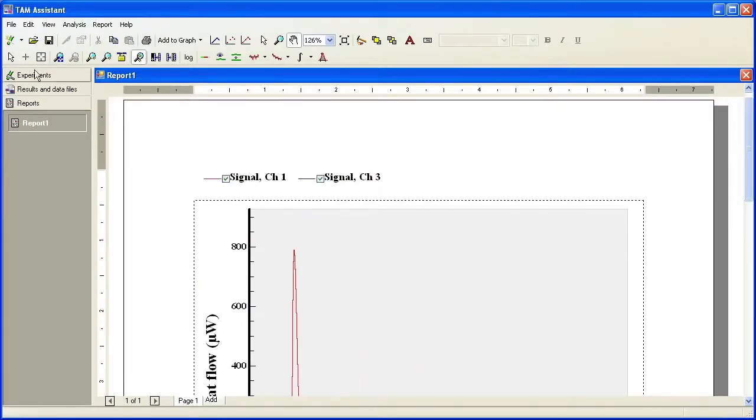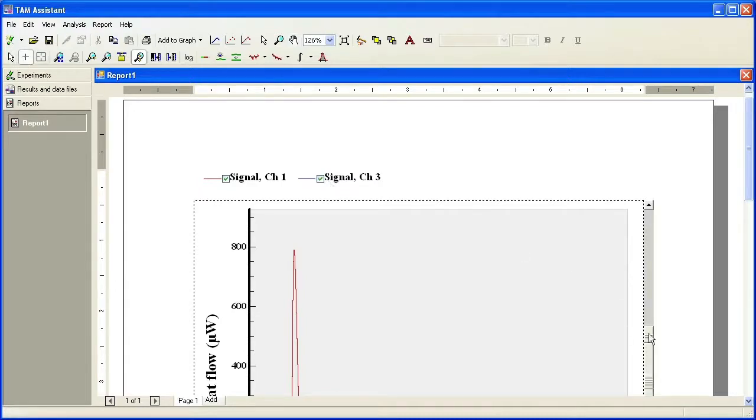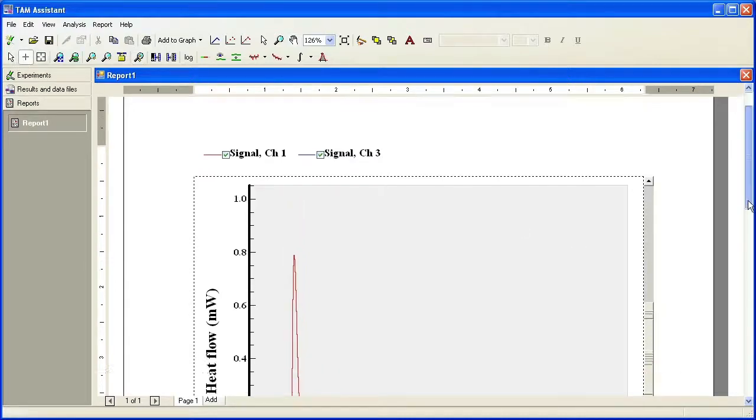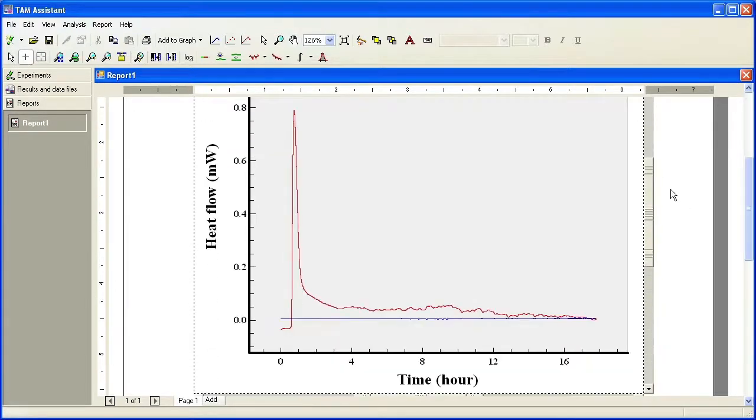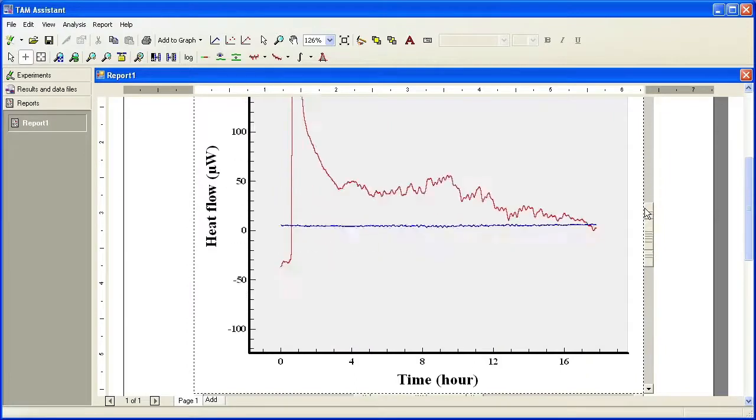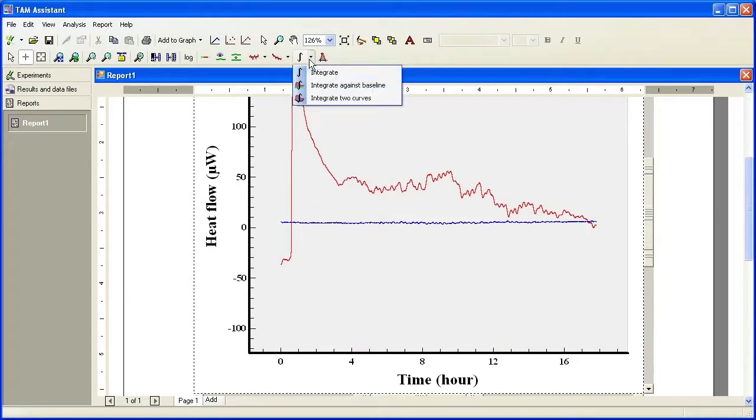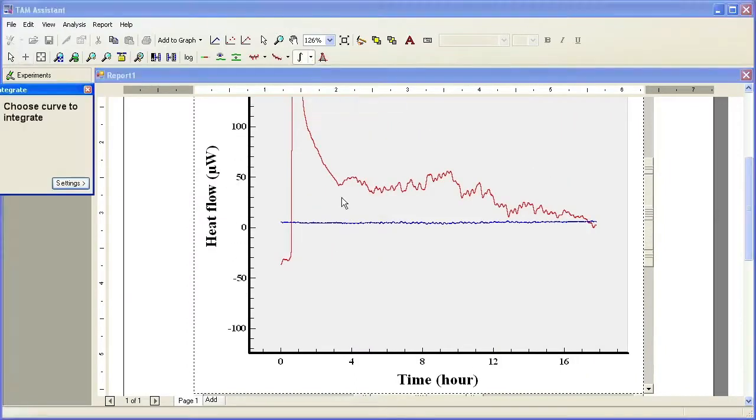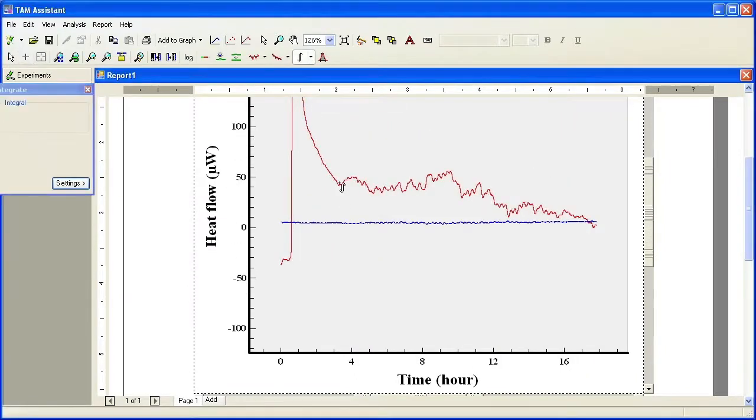So now you can utilize the zoom mode and you'll be able to zoom in on the plot. Here, let me drag down. You can zoom in on the plot. You can perform integrations or you can perform fits.